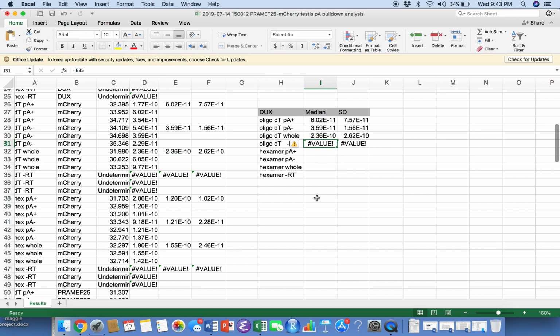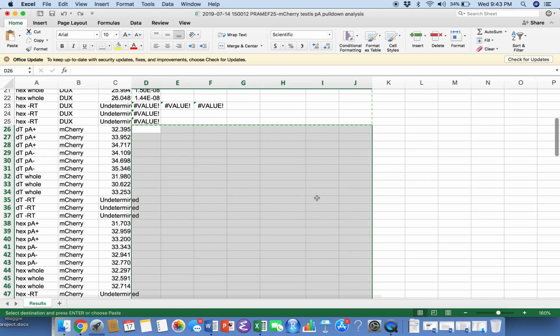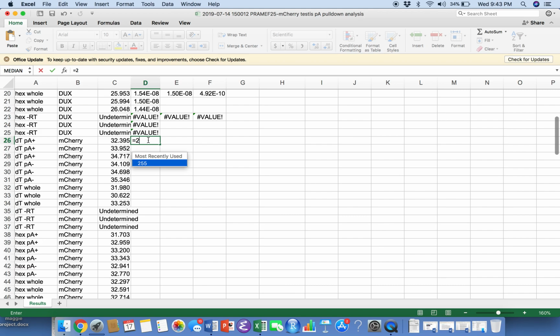And you could just copy and paste your way through this. But I don't recommend that for learning. I am going to leave these top equations, but if you could try to calculate through it, I think it would help you better understand a little bit of what you're doing here. And then when we get your data tomorrow, then maybe you could process it yourself. And that's not a requirement. I could totally help you process it later too, but I just thought it would be cool if you could bring your data from beginning to end and then present graphs.